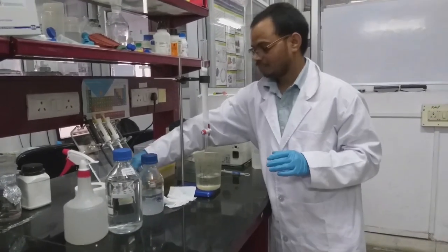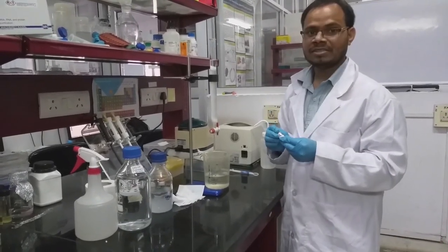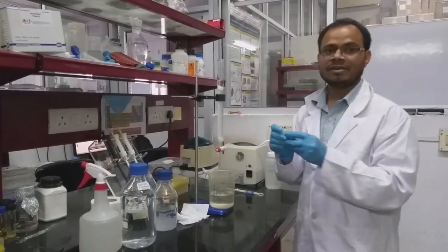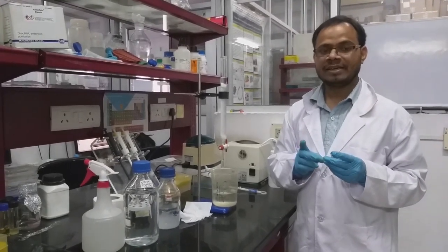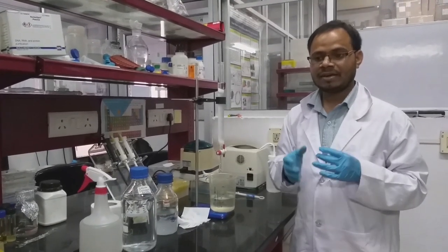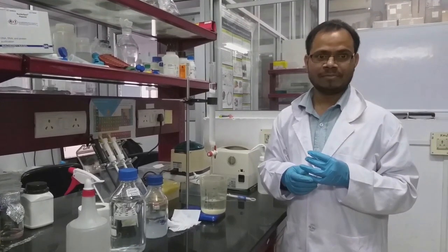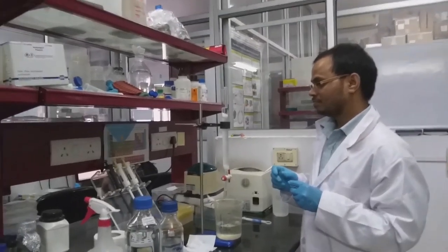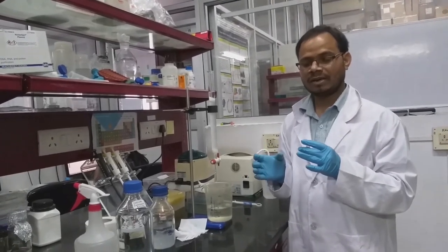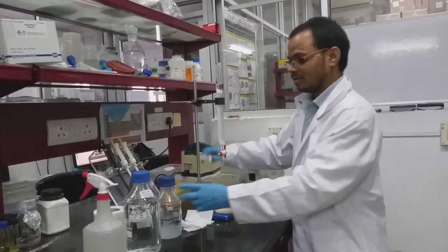Here, loading the sample, it is better practice to load it with the beads rather than the sample alone. So this is our sample, which contains one component, 2000 kDa blue dextran, which is a glucose polymer, a polysaccharide, and the other molecule is a colored compound of 0.5 kDa. By principle, blue dextran, which is blue in color, elutes first, and the small molecule elutes later onwards. So we will load the sample.